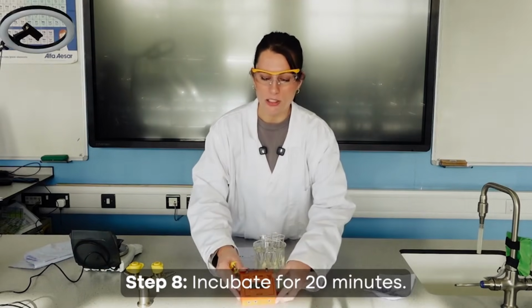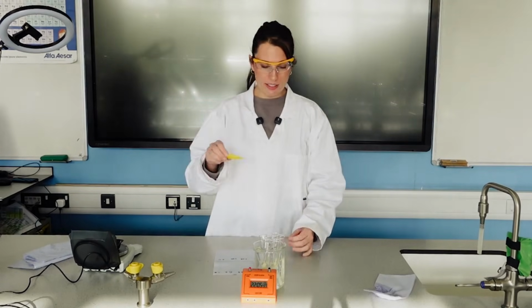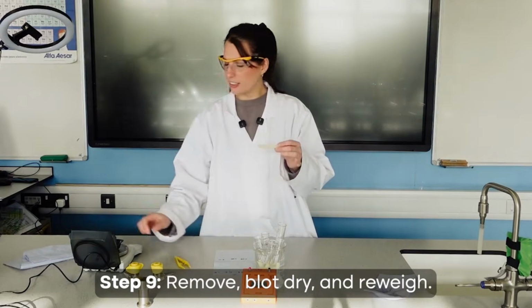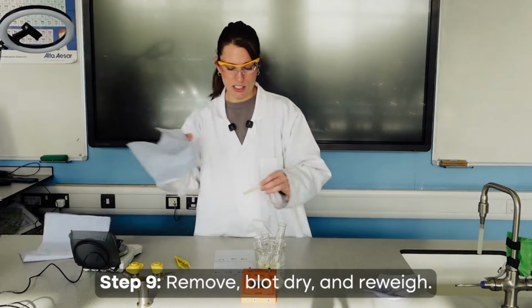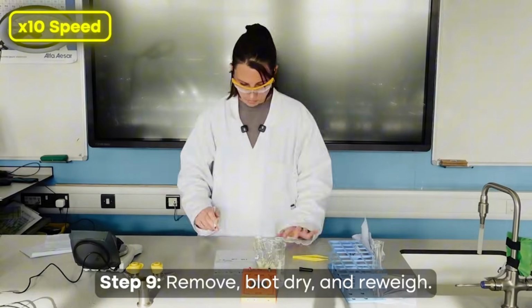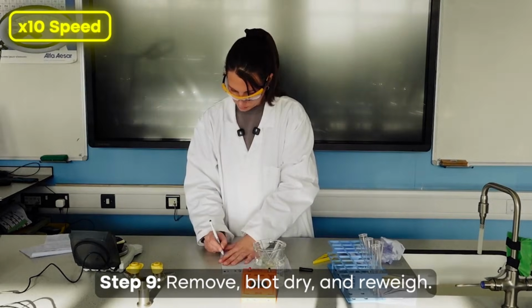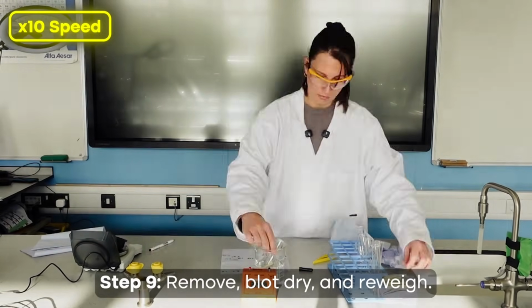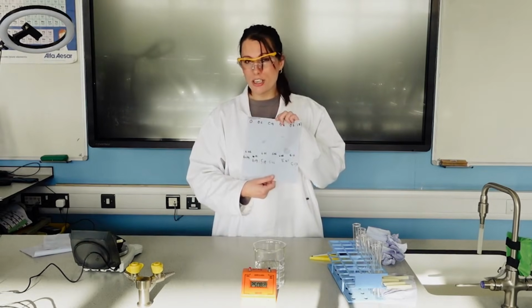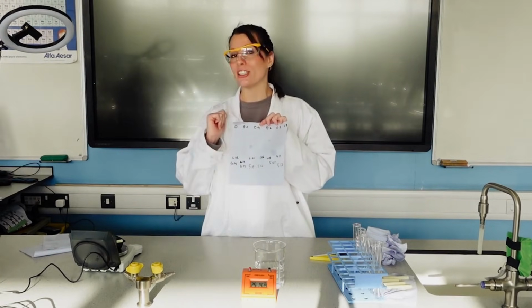Right, so for us it's been, I think, about 20-25 minutes. So we're now going to take those out and measure the final mass. Now I did have forceps, so as you can see, didn't actually fit in. So sometimes it is easy just to have a sieve, pour it into the sink and do it that way. Now we've got our final results as well on a tissue, but that would then need to be recorded into a proper table and plot your percentage change in mass against the sucrose concentration.